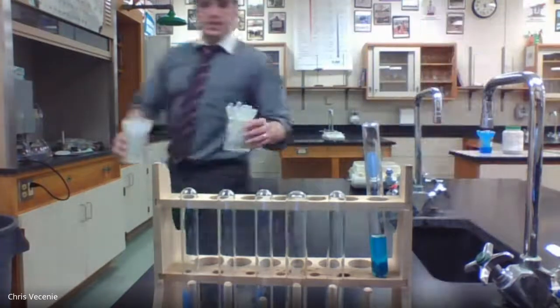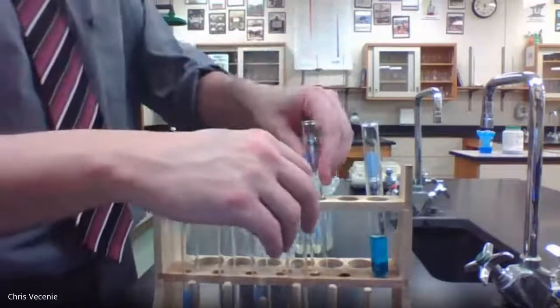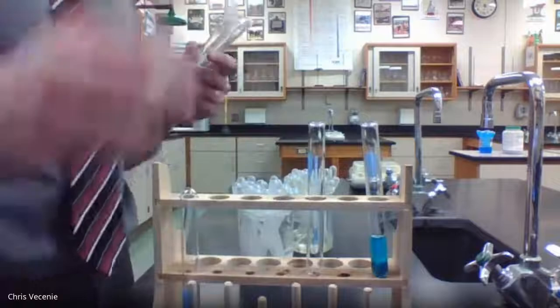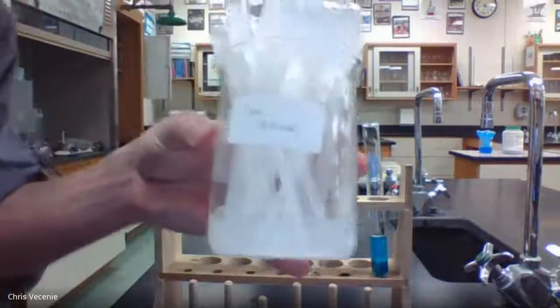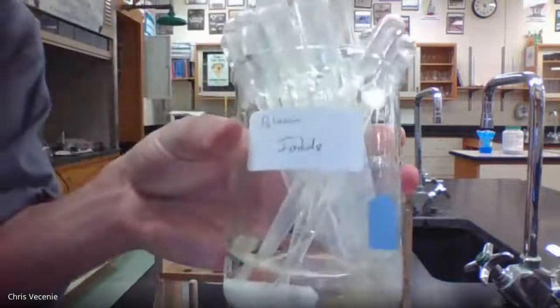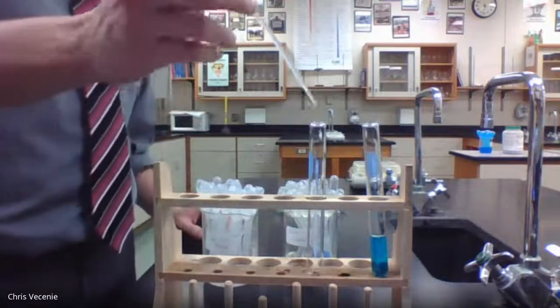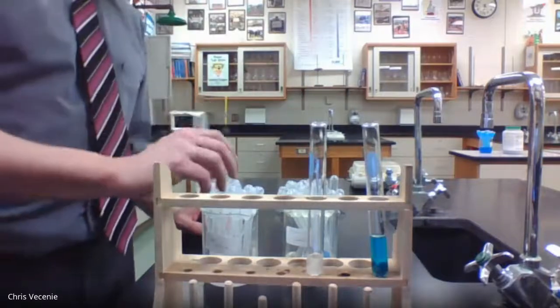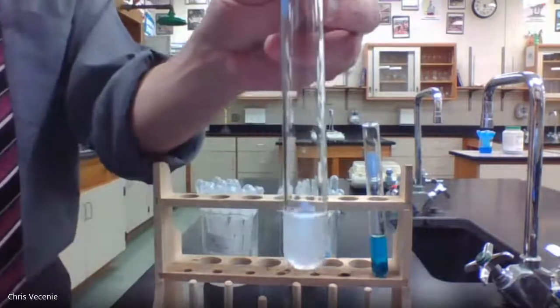What I'm going to do is take you into experiment number 2. I'm just going to move these so you can get a good look. In experiment 2, I'm taking lead II nitrate, which is a clear colorless liquid, and reacting it with potassium iodide, another clear colorless liquid. So we're going to take a pipette of the first one, squirt it down in there, take a pipette of the second one, and add it to it.